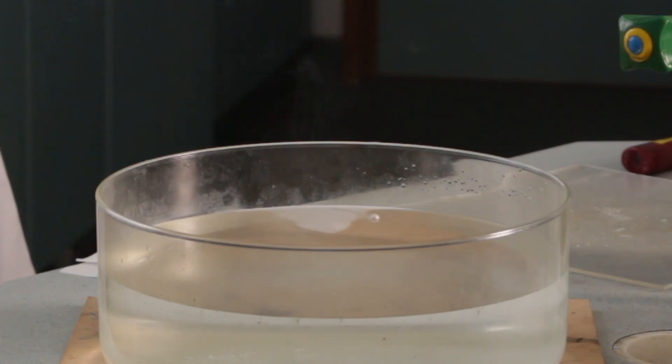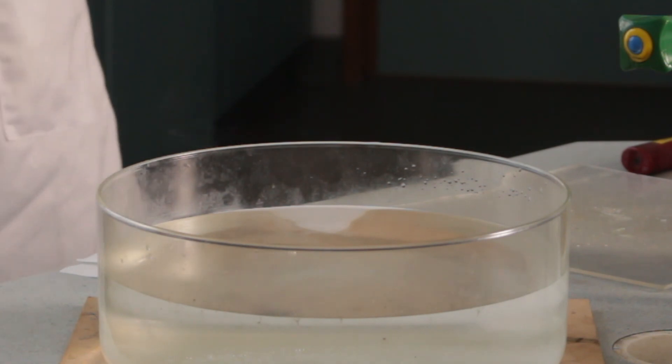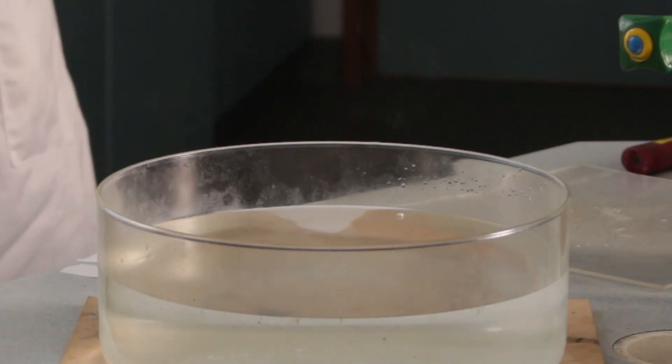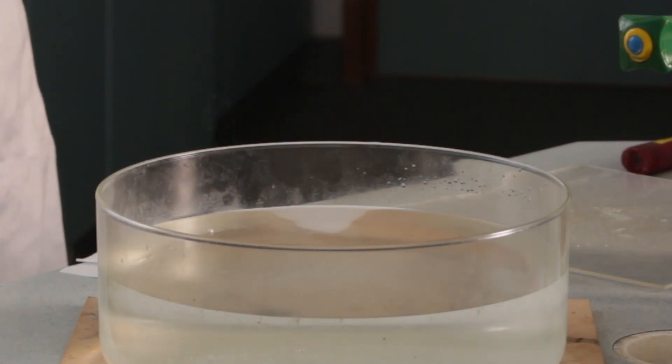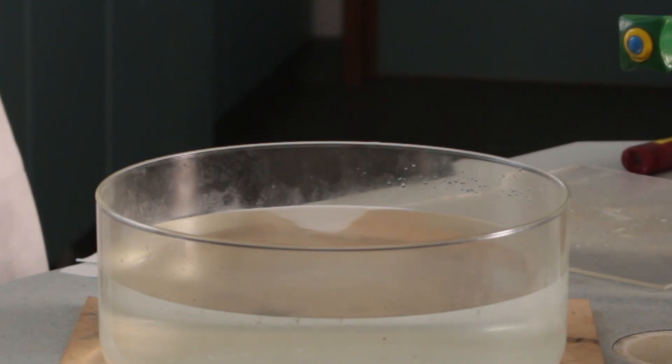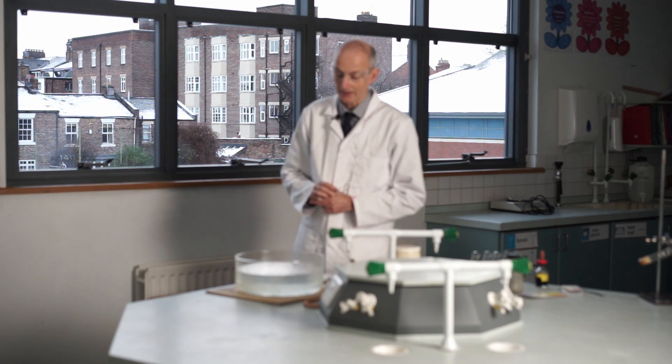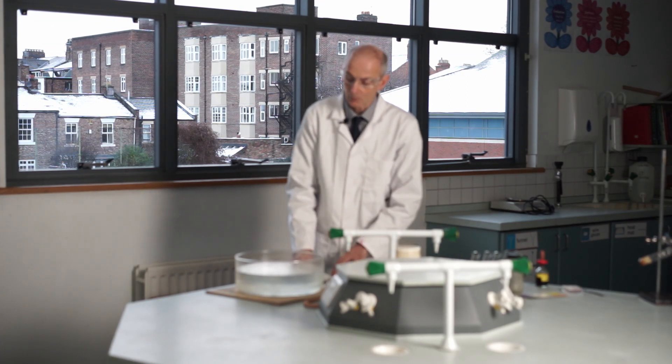There are big chunks; it's taking a while to disappear, but it is getting smaller and smaller, moving across the surface. The water is still colourless and clear — there doesn't seem to be any obvious change there. So it's obviously producing a gas, but it's not immediately obvious that it's producing anything else as it reacts.